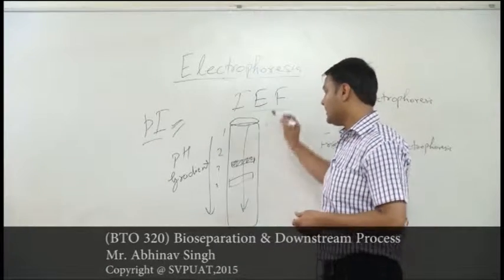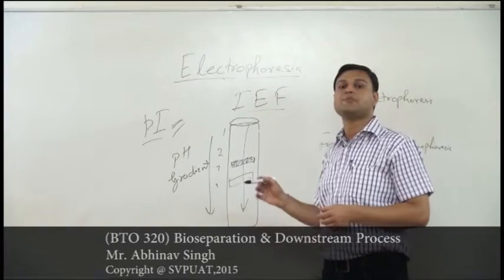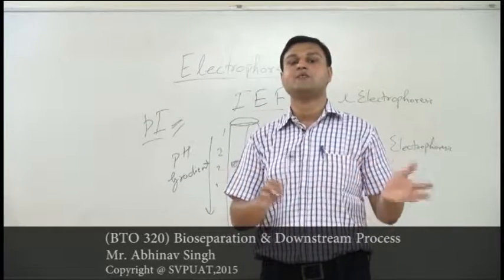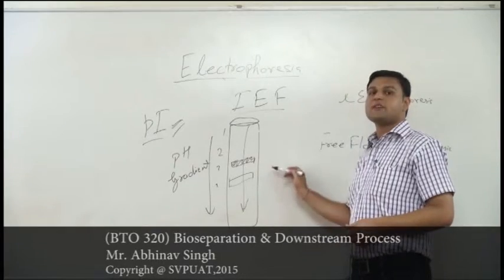The mobility in this particular phase for that molecule will be neutral due to the absence of charge. Actually, the charge is not completely absent, but it is neutralized due to the equivalence of both the charged forms. This is the basic principle of the isoelectric focusing technique.